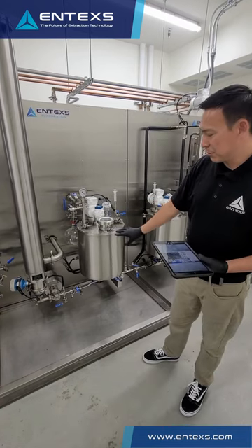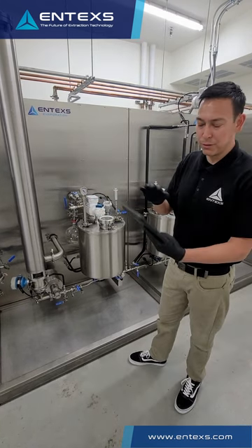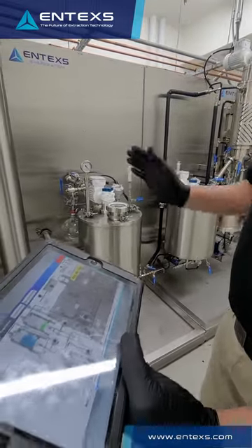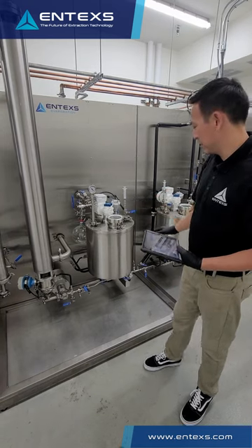All of this is sensored with level sensors, temperature monitoring, and vacuum level sensors, and controlled via the HMI. So you can come over here and press start, and the whole system just runs. It's very hands-free and allows you to stay in front of the process while monitoring tank levels or whatever you're doing.